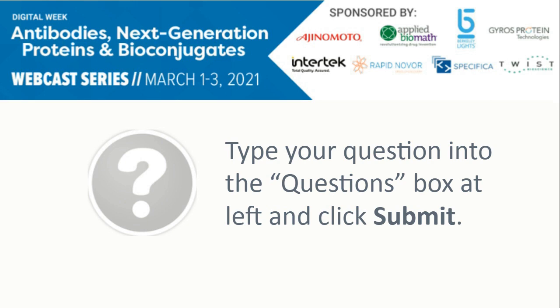And so yeah, we do the protein G purification, but subsequently we still do the antigen specific affinity purification as well, which definitely helps when we do the LC-MS workflow. Yep. All right, great. Next question.